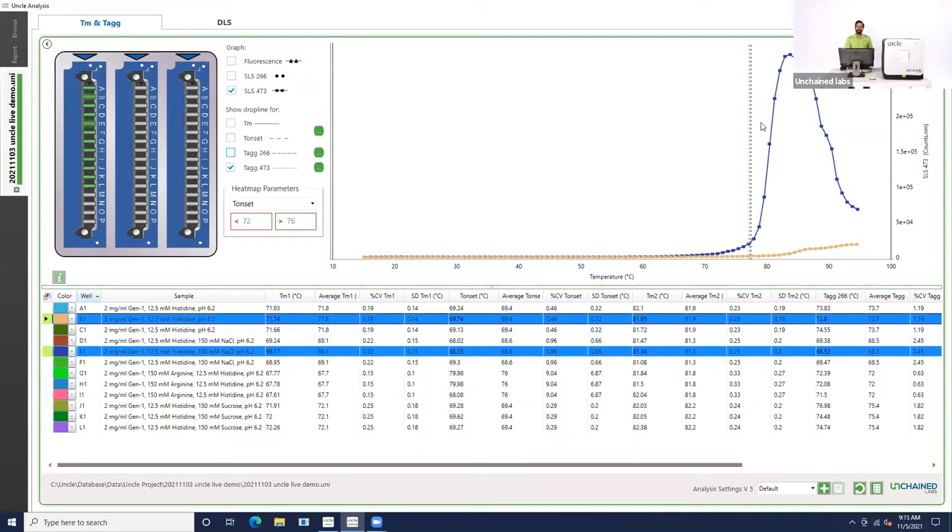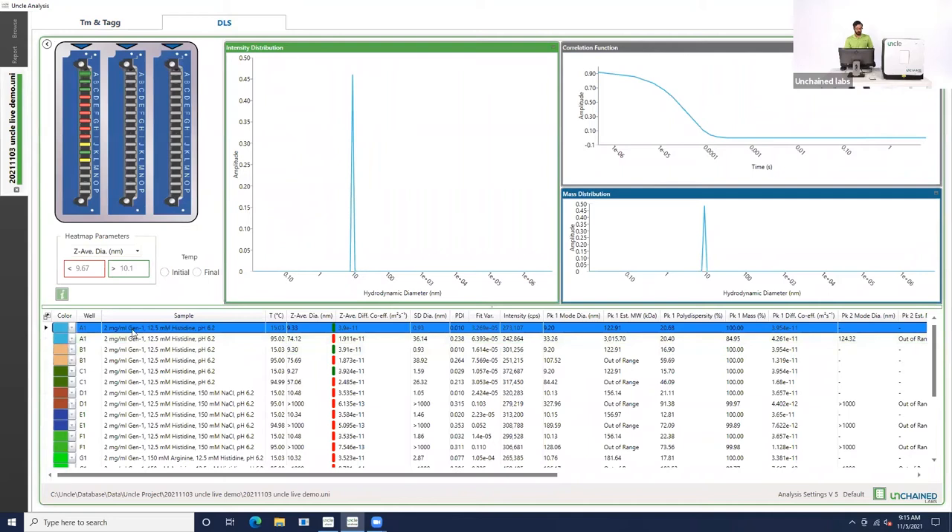You might be wondering why the intensities are so different — one of the ways we can find out is by taking a look at DLS. Toggling to the DLS tab, we're looking at that antibody in histidine buffer at 15 degrees Celsius. You can see that the Z-average is about 9 to 10 nanometers, which is what we expected for this protein. The PDI is less than 0.1, indicating it's nice and monodispersed. Based on just looking at the intensity distributions and the mass distributions, that's the case. This protein is very happy — monodispersed, no aggregates, very nice and clean, and a good sample to be doing thermal ramps on.